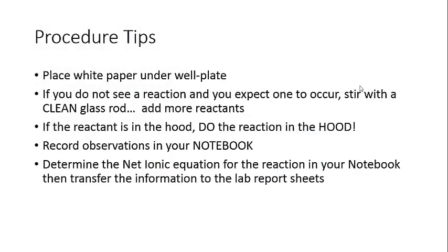Some tips as you go through. I suggest putting a white piece of paper underneath the well plate so that you can see the reactions a little bit better. Again, if you don't see a reaction but you do expect one to occur, you can stir it with a glass stirring rod. Make sure it's clean. If you contaminate between wells, you'll have no idea what's going on because you might see a reaction and it's just because you carried over some reactants from a previous well. So you don't want to do that. Make sure you keep that glass stirring rod clean.